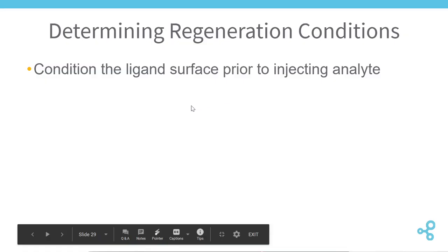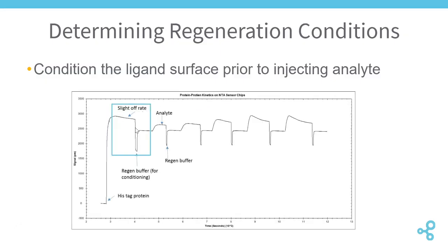So here, where we see this slight off rate, the ligand is slowly dissociating from the sensor surface.